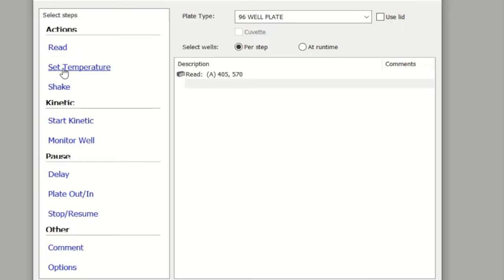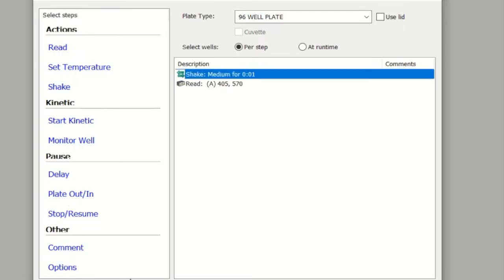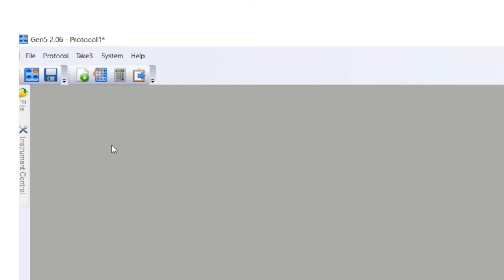Temperature as well you get to set. It's got an incubator that's like default on. I don't need the incubator on. I want to just read at room temperature. I've done the procedure. I've defined the steps that it needs to follow.